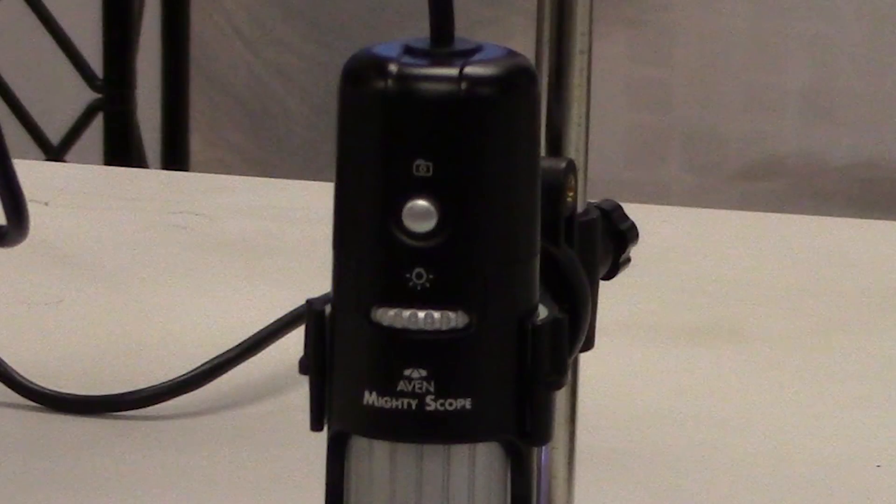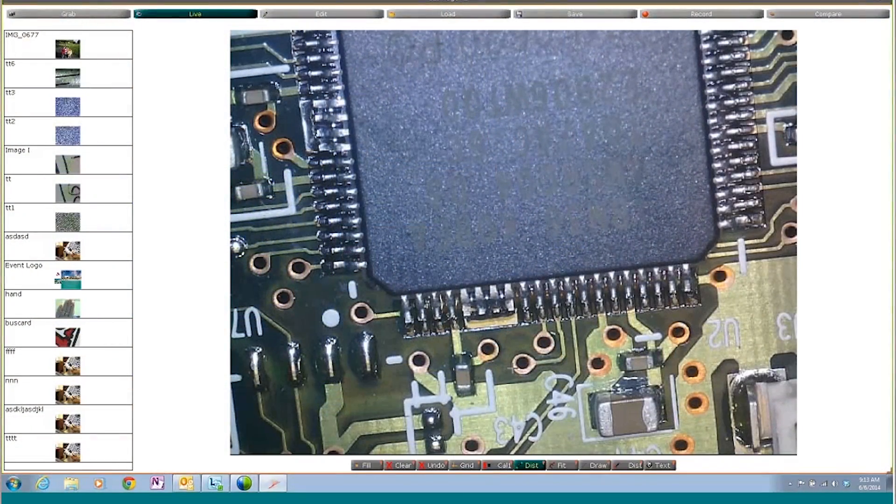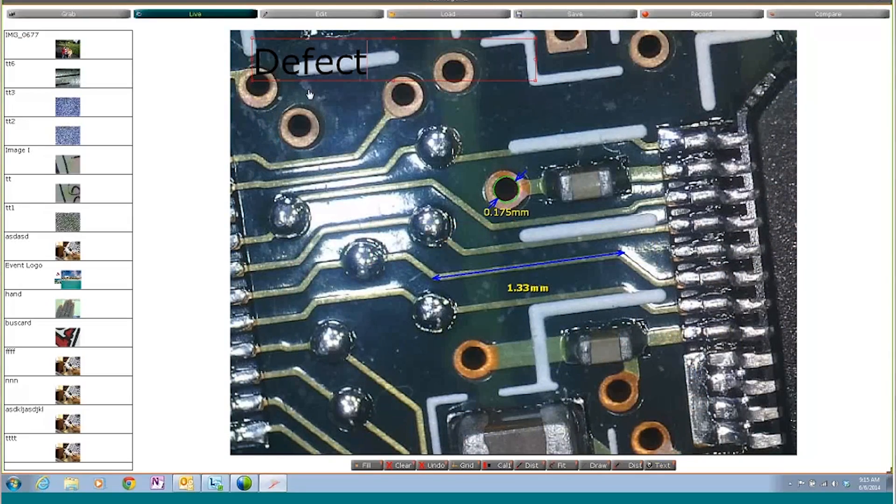All Mighty Scope units offer an image capture button on the microscope body, as well as the software, allowing for maximum flexibility at no additional cost. The truly world class software that comes with every Mighty Scope allows you to capture an image, take a video, accurately measure lines or geometries, and make notes and annotations right on the screen.